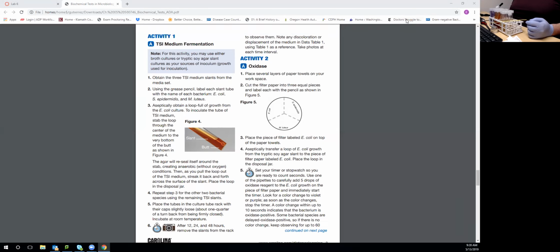Okay, so here, I've got my materials here, okay? And I just grabbed a rack of items because I happen to be lucky enough to have everything that I could ever need here. I make my own triple sugar iron. Let's see, can you see that? There we go. I make my own TSI. I make my own, well, everything.